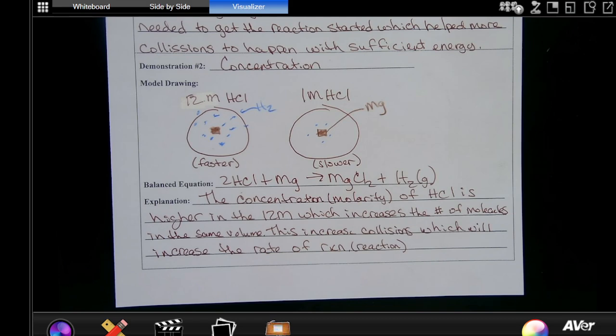All right. The next one I'm going to set up is going to be fun. It's glow sticks. This one's hot, so I'm going to put this one up there. Does anyone still need this one up?